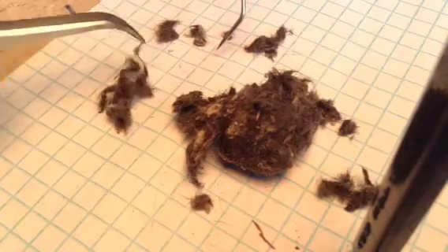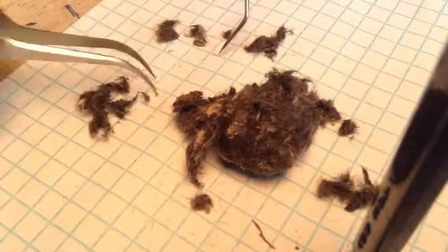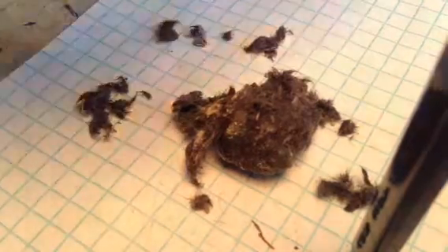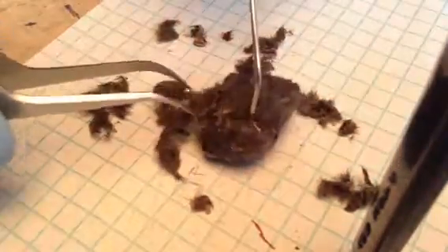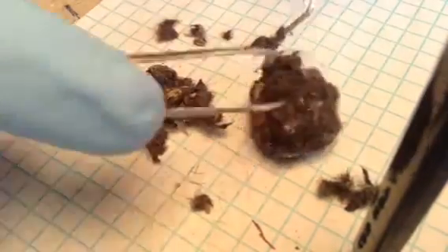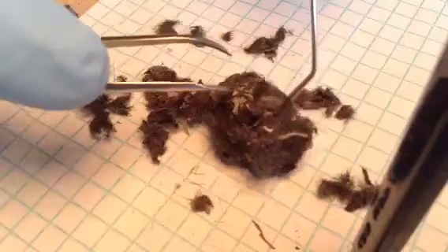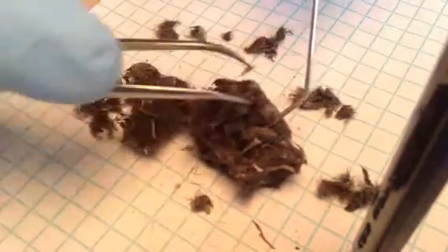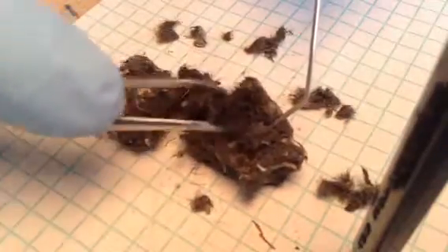This looks like a little arm bone right there. Let's continue into the pellet. Looks like we've got a pelvis somewhere in there — rip it apart.